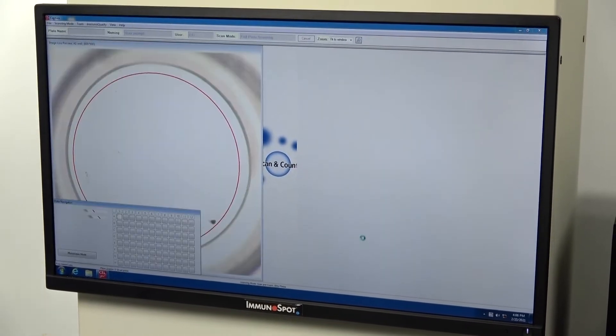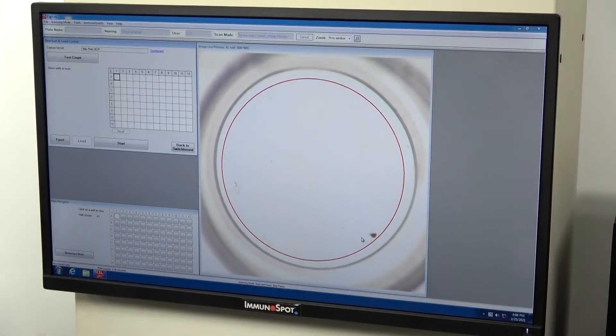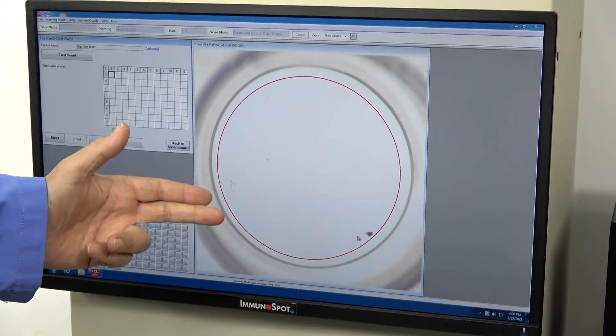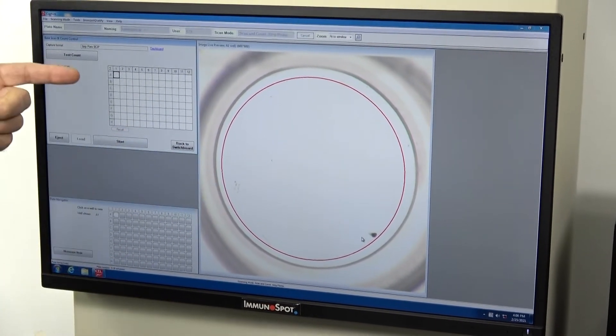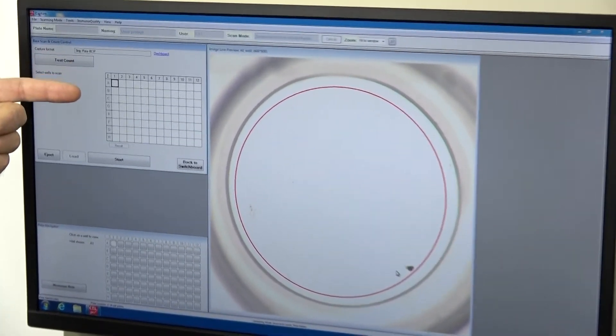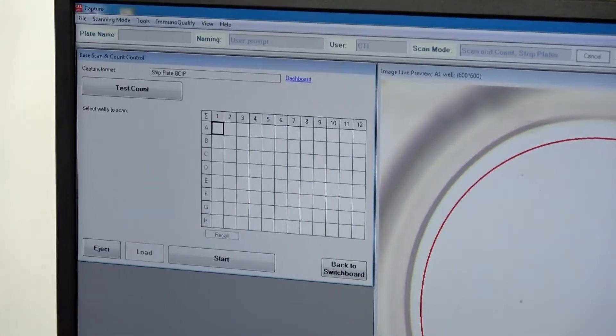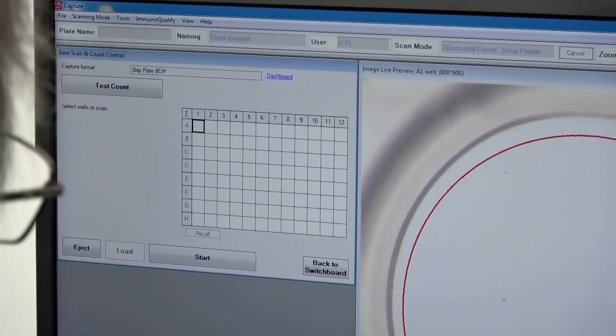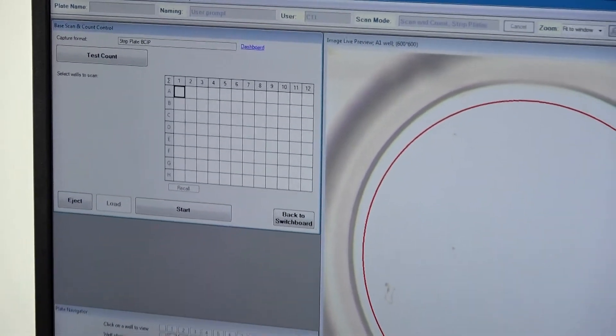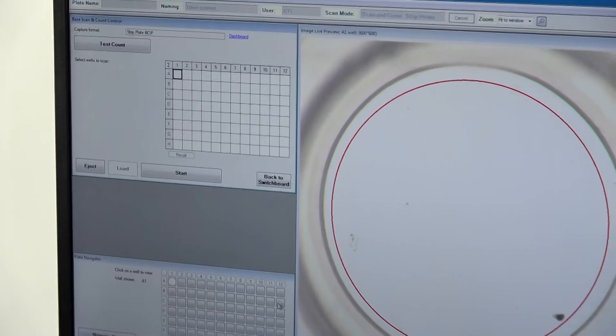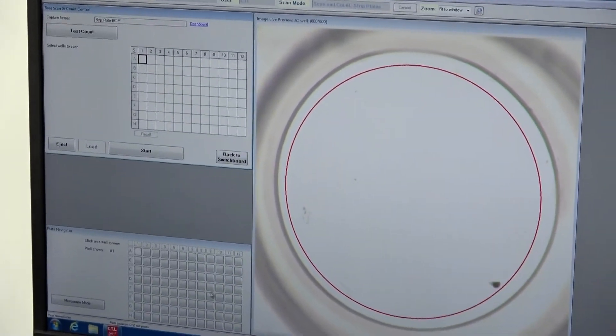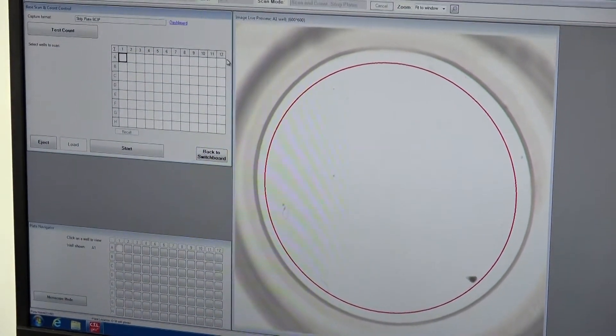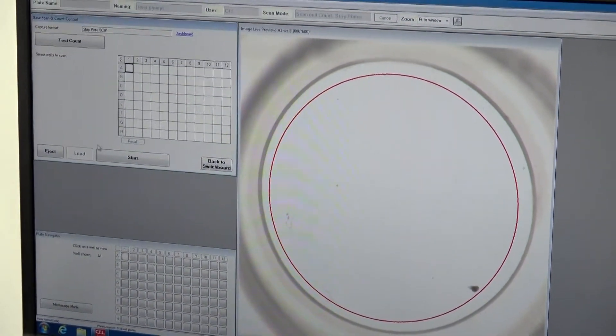And this is actually a live image here, showing exactly where it is on A1. We can easily move the unit to different wells. We're just going to go ahead and load the sample.